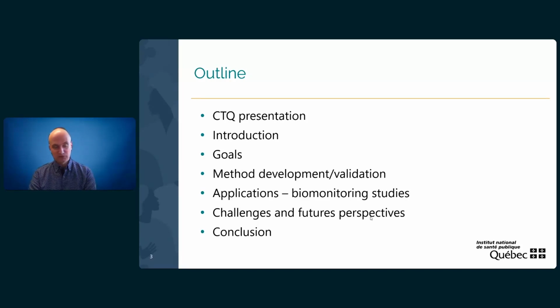I will go into details with the method development and validation, which make use of Mitra VAMS devices. I will show you also a few applications, especially related to biomonitoring studies. And I will finish by discussing some challenges and future perspectives. And of course, I will wrap up with a conclusion.